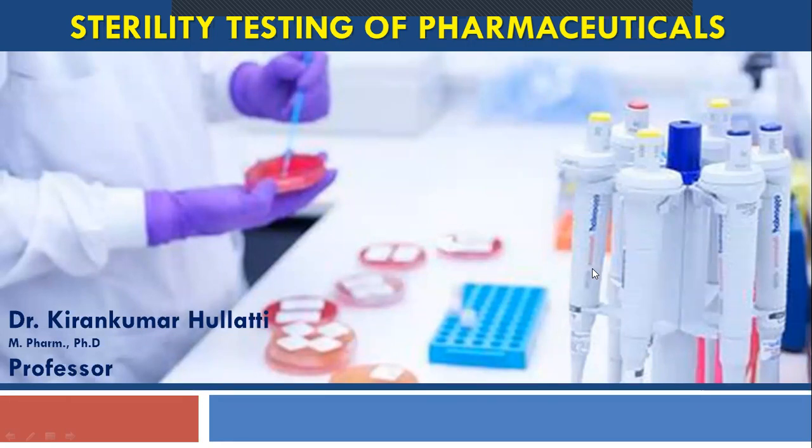Suppose we put the sample in a media. Of course, here one thing you should remember: in the product we are taking for the sterility testing, even if the microorganisms are present, if sterilization is not complete, so even though some viable organisms are remaining, the number will be very, very minimal, first thing. And second thing, they have encountered a very harsh environment, so they might have become very weak.